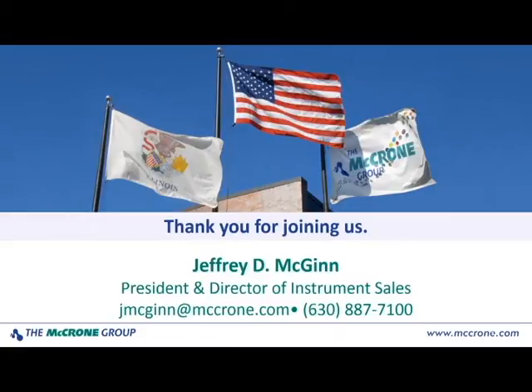Yeah, thanks, Jeff. We have some questions rolling in here right now. From James: can you compare the JCM 6000 Plus to a full-sized SEM to help him understand where the limitations might be between JEOL instruments? Obviously, a full-size SEM has a higher magnification range. Some of them go up to a million times mag. The NeoScope, or the 6000 Plus, only goes up to 60,000x. It has 3 set voltages of 5, 10, and 15 kV, whereas on a full size you may get a much wider range.